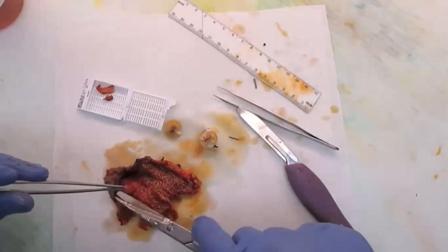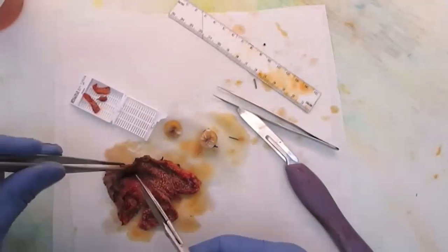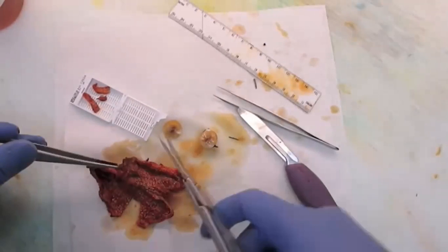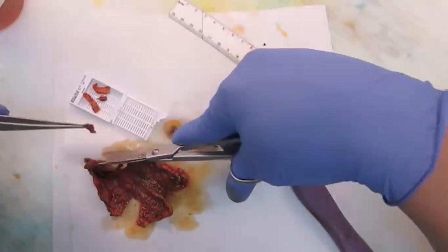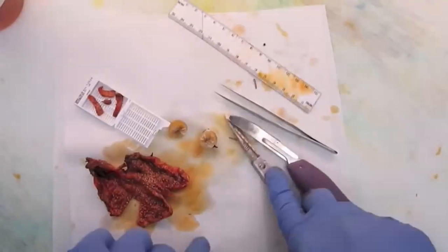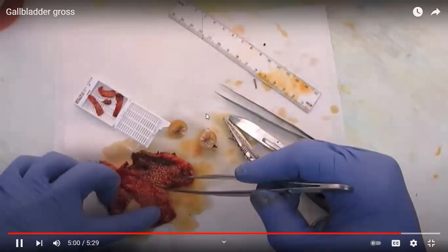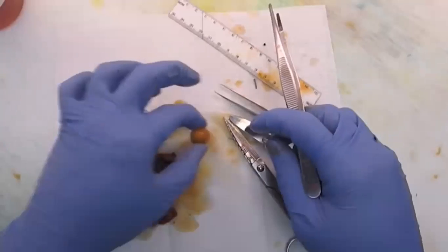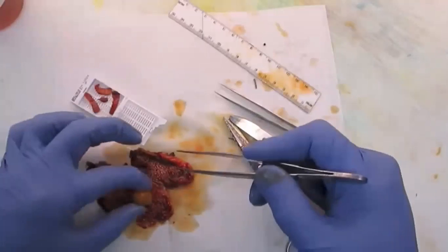So here's from the body, and here's a big one from the neck. Microscopically, you won't be able to tell if it's from the neck, body, or fundus. But this is just a way to sample it, a good sampling of the specimen. Okay. Now, this mucosa is really denuded. Sometimes when there are stones in here, the stones rub on the mucosa and it kind of denudes the mucosa.